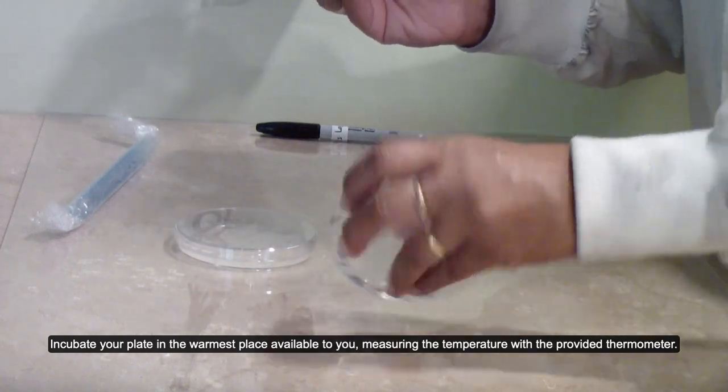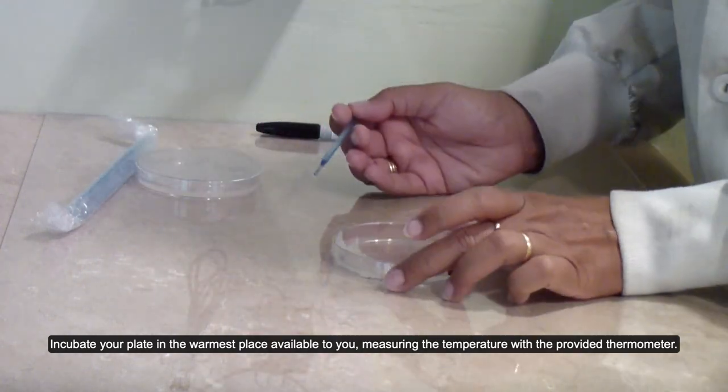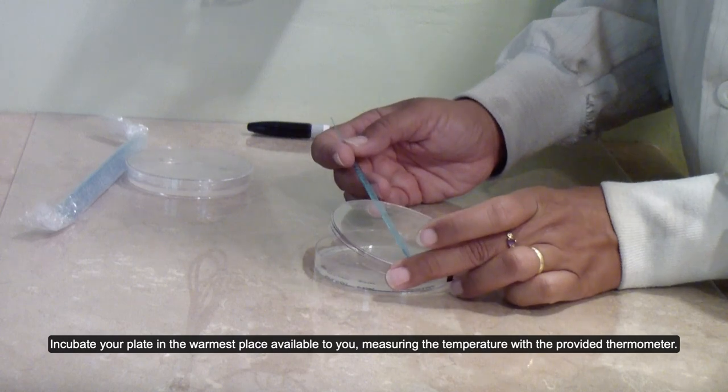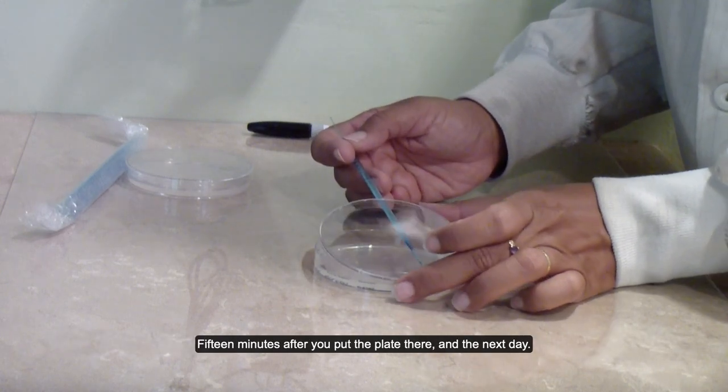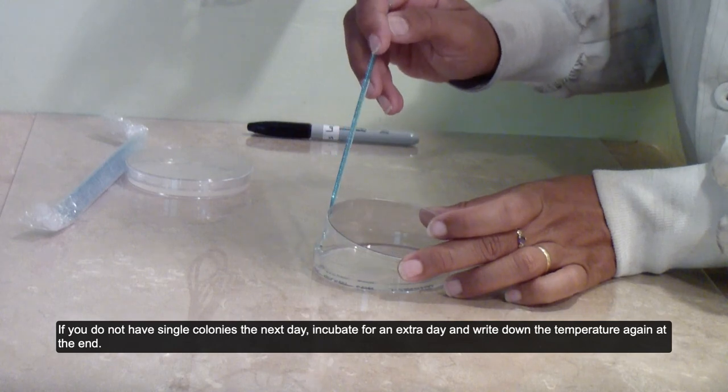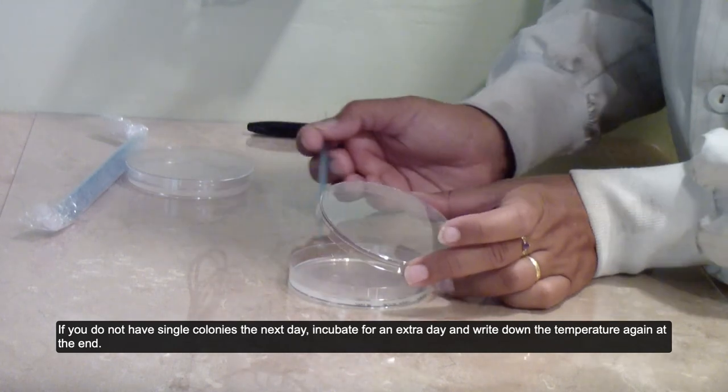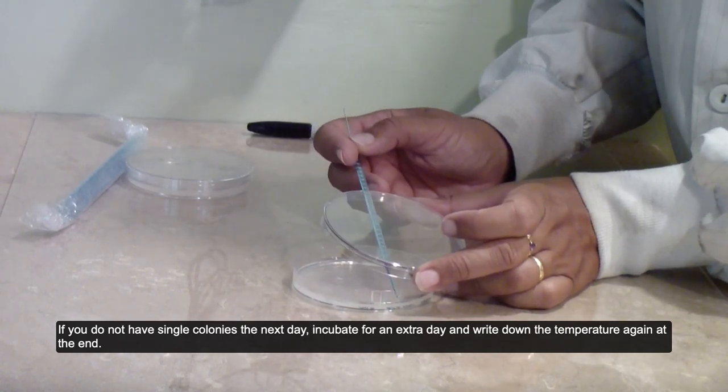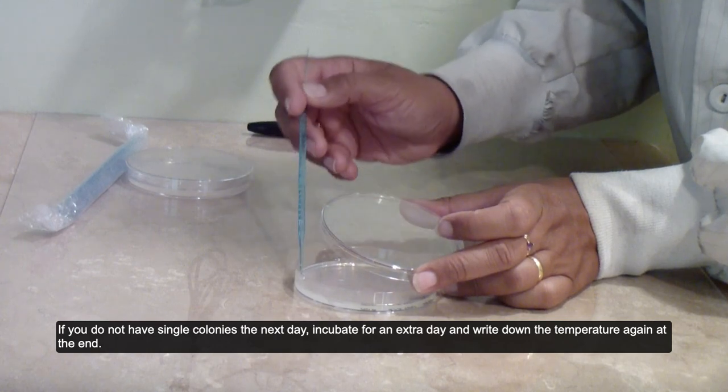Incubate your plate in the warmest place available to you, measuring the temperature with the provided thermometer 15 minutes after you put the plate there and the next day. If you do not have single colonies the next day, incubate for an extra day and write down the temperature again at the end.